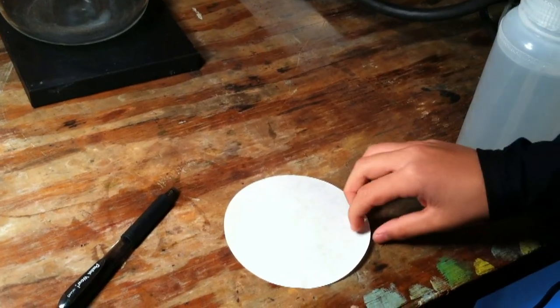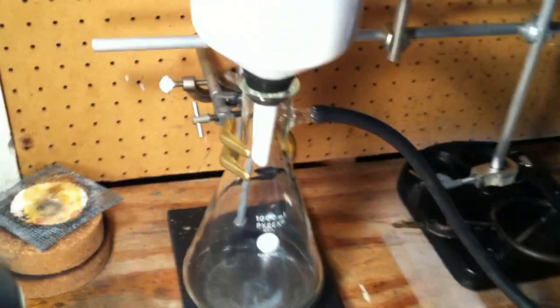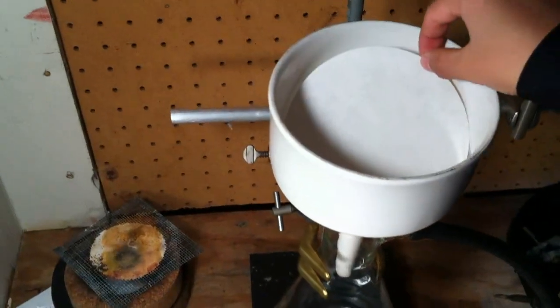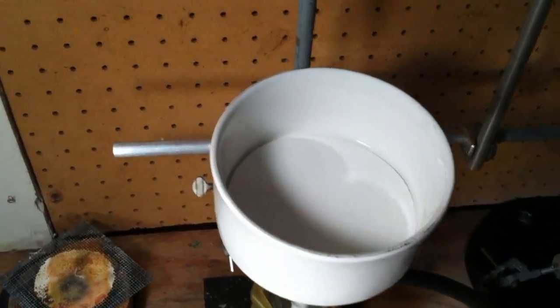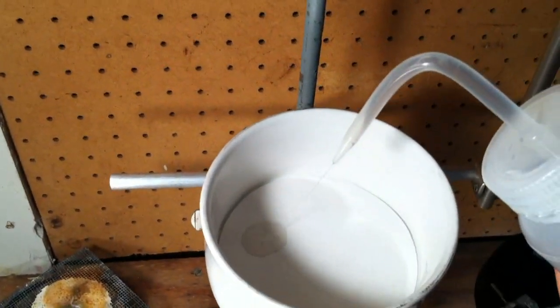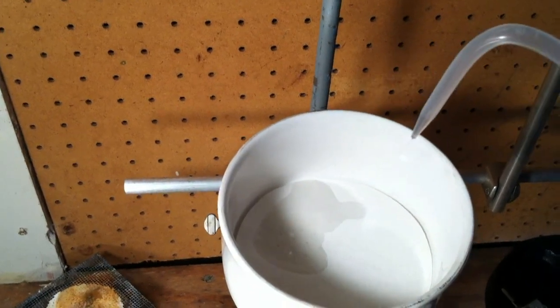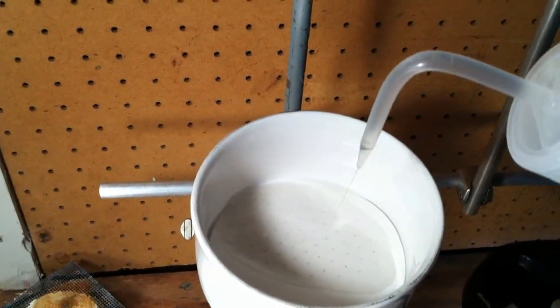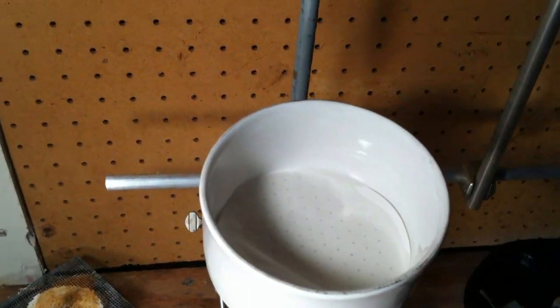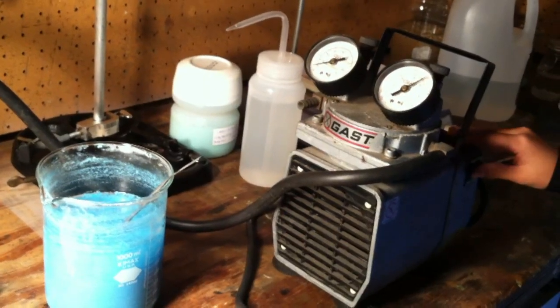Now add the filter paper to the Buchner funnel and squirt some water on it so it can be wet with distilled water. Turn on the vacuum pump.